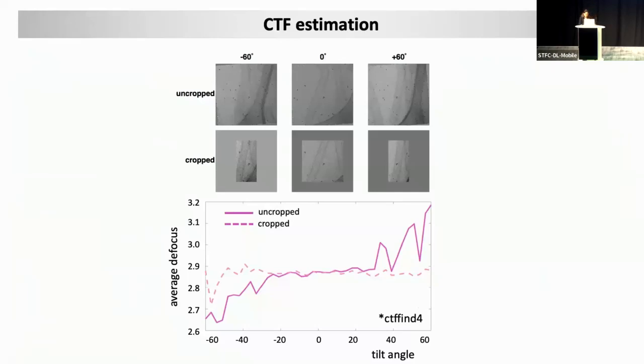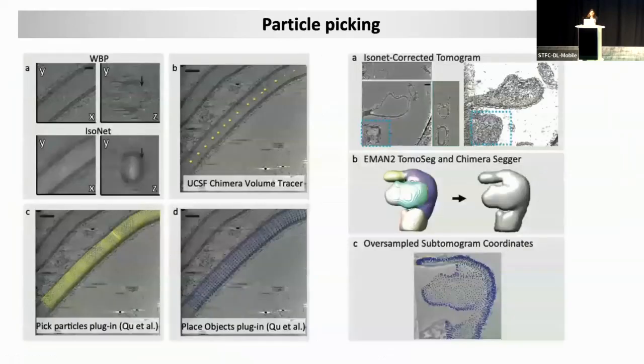So for the particle picking, as I said, this is project dependent. We have a number of different tricks that we use. A lot of people picking particles on membranes can exploit the membrane geometry. For example, if it's tubular, you can just pick the axis of the tube, and then the particles would be automatically picked on the tube surface. You can do the same with spherical vesicles. If you have irregular membranes, that's a little bit harder, and you usually have to manually segment the membranes.